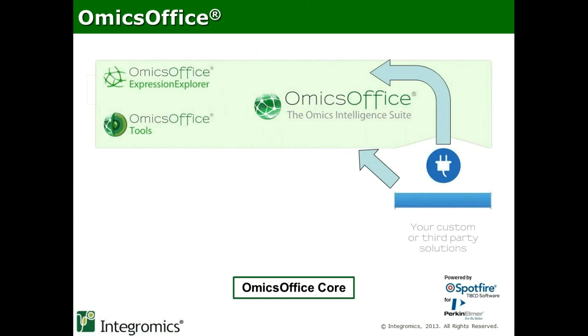This data can come from any third party, such as you could be analyzing your data using solutions from Partek, from CLC, or non-commercial solutions such as R. And you can get a set of expression levels, and these can be loaded into OmicsOffice.